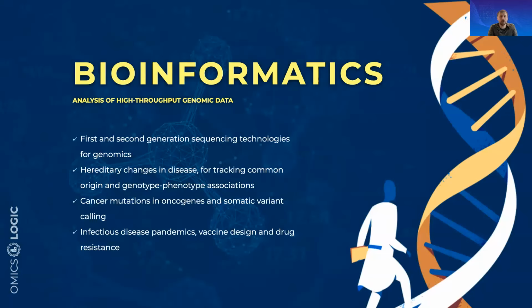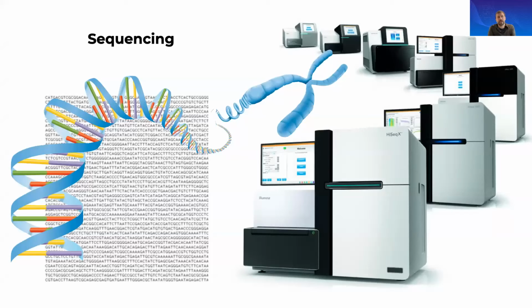And then we'll talk about several examples, and I'll actually use just one example today, and that will be an example from cancer. Next generation sequencing, as I already mentioned, has evolved dramatically over the past couple of decades. Originally, it started from a technique that was very expensive and labor intensive. And eventually now it is becoming more and more automated, as well as cheaper and more accessible.